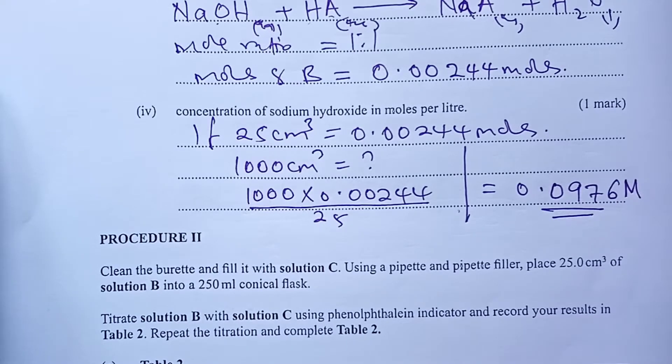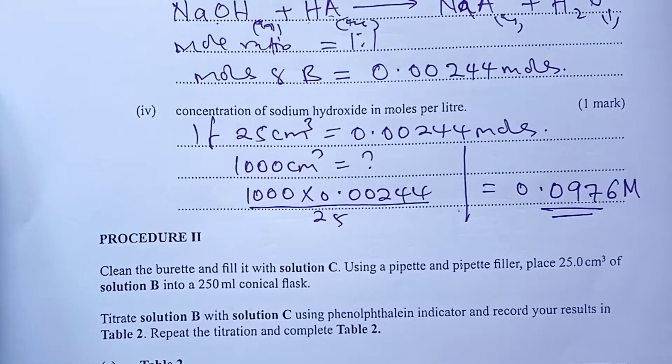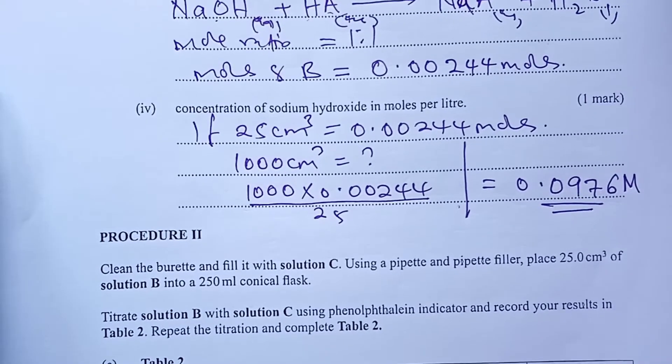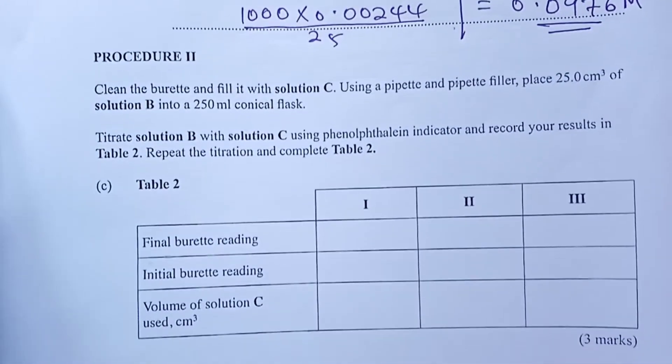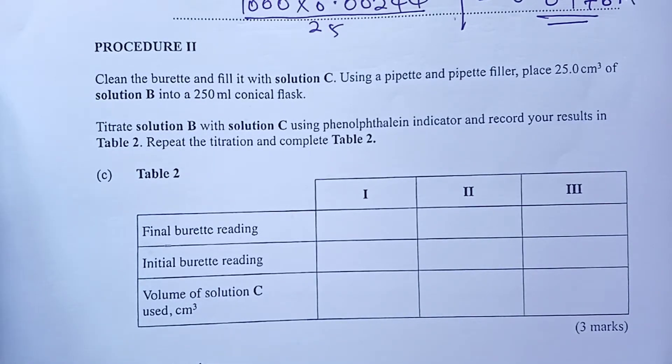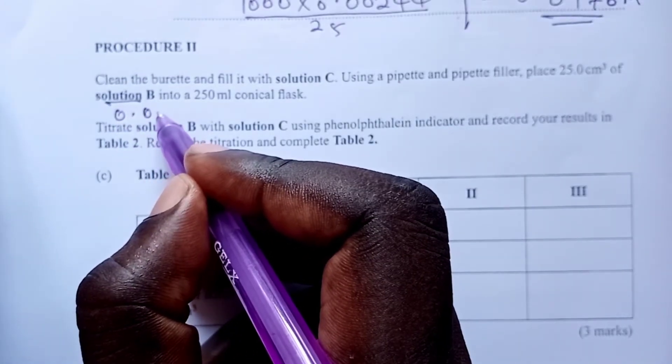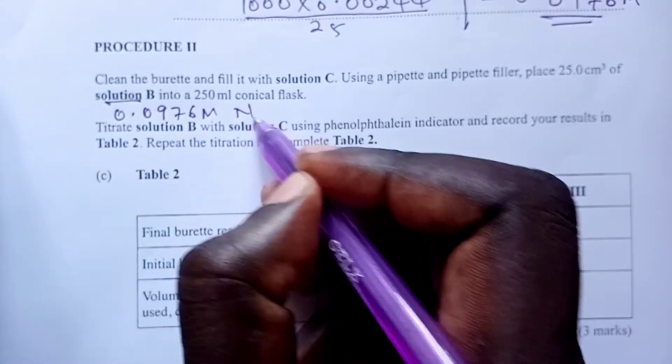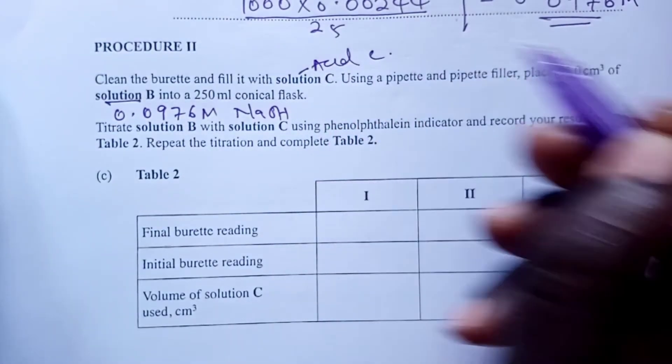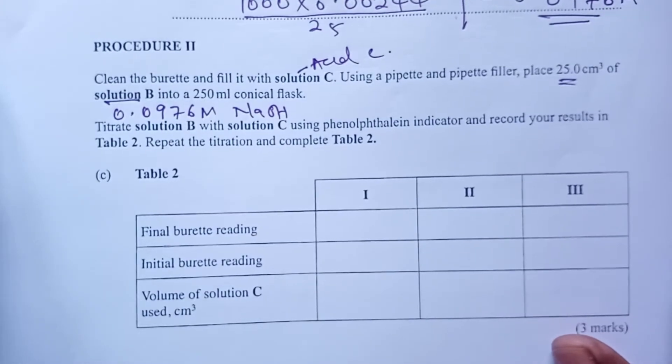So as I explained earlier, this was a double titration. So having finished with titration 1 and having done all the calculations that followed, we were supposed to do another titration in procedure 2. Let's have a look. So clean the burette and this time we are filling it with solution C. Solution C was an acid C which is not known. So using a pipette filler, place 25 of B. So this time around, B, we have been able to calculate its molarity and we have found 0.0976 molar sodium hydroxide. This one is acid C which is not known. And of course we are using 25 of the sodium hydroxide. Now moving on.